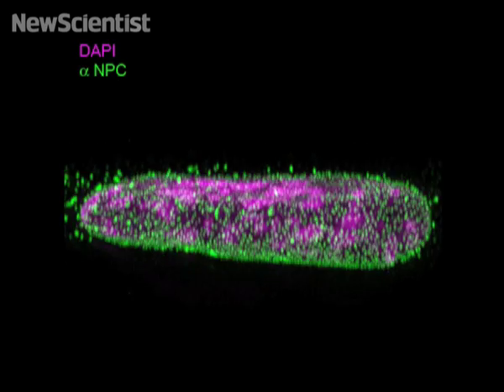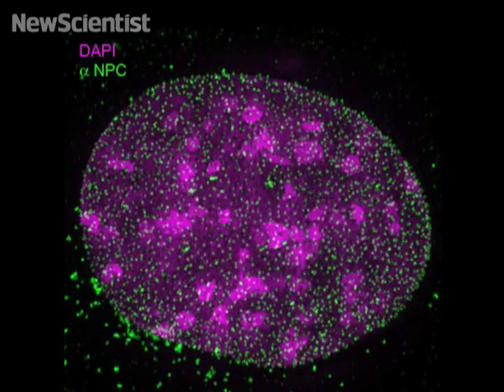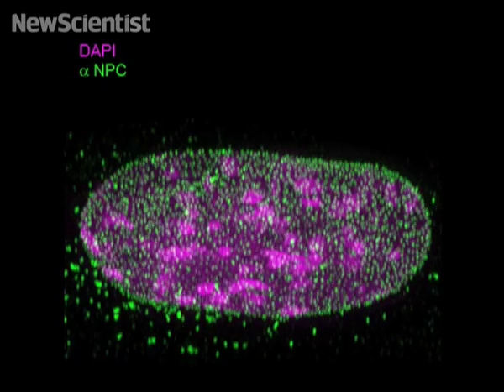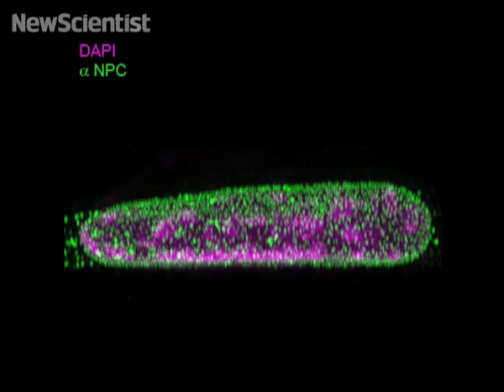In color and in 3D, even if they're only 100 nanometers apart. By shining structured patterns of light on specimens, an interference pattern is created which enables us to extract information about their shapes even if they cannot be visualized directly.